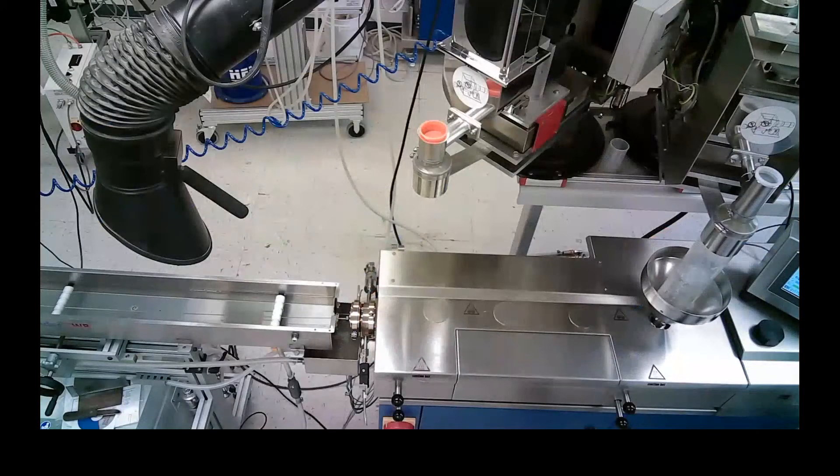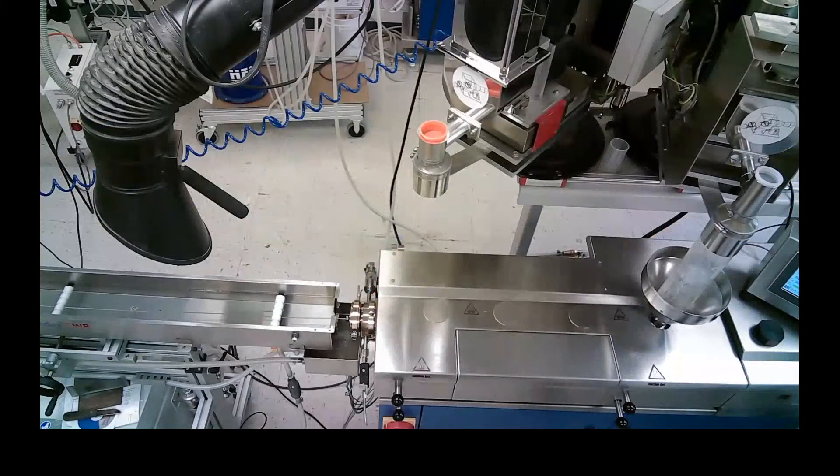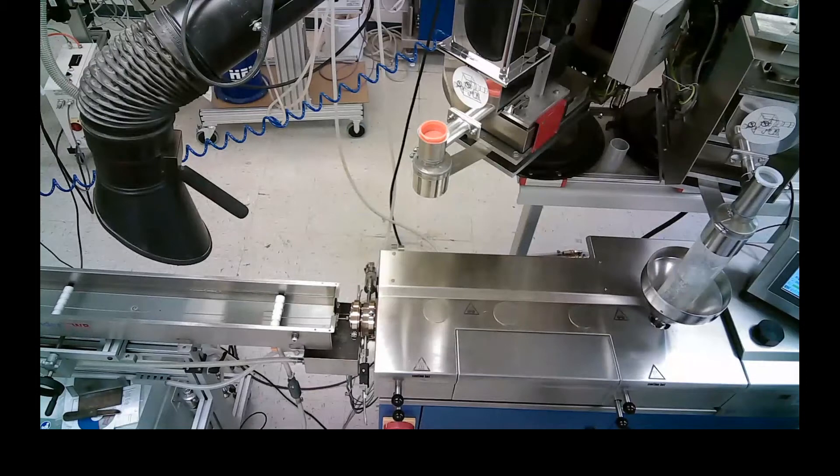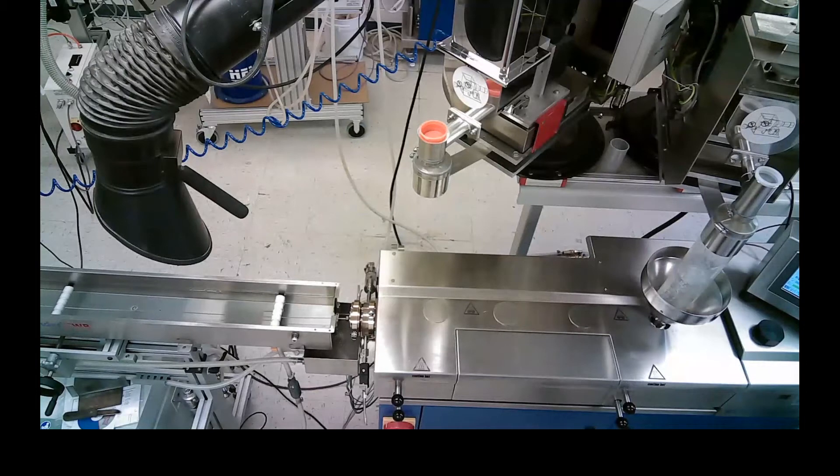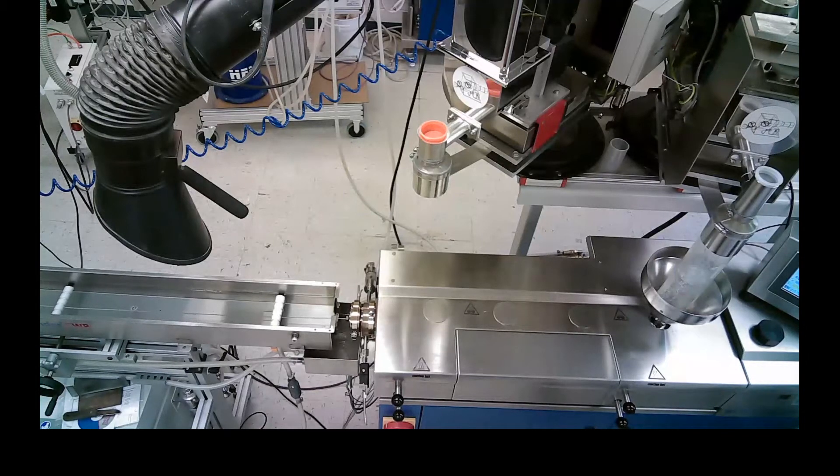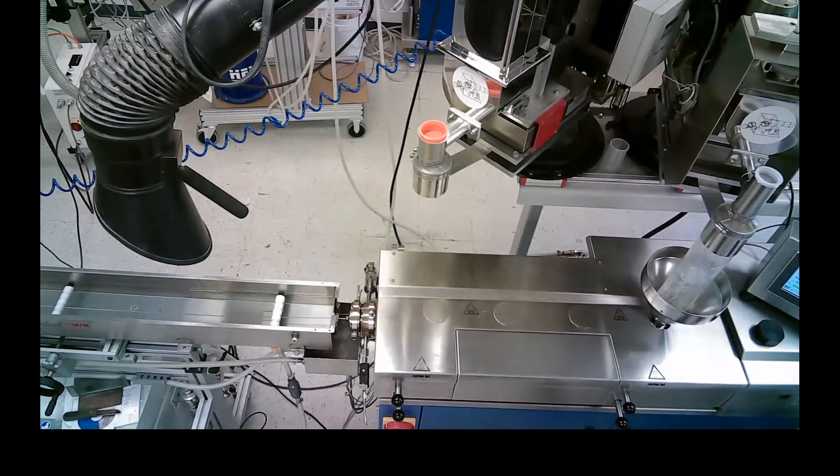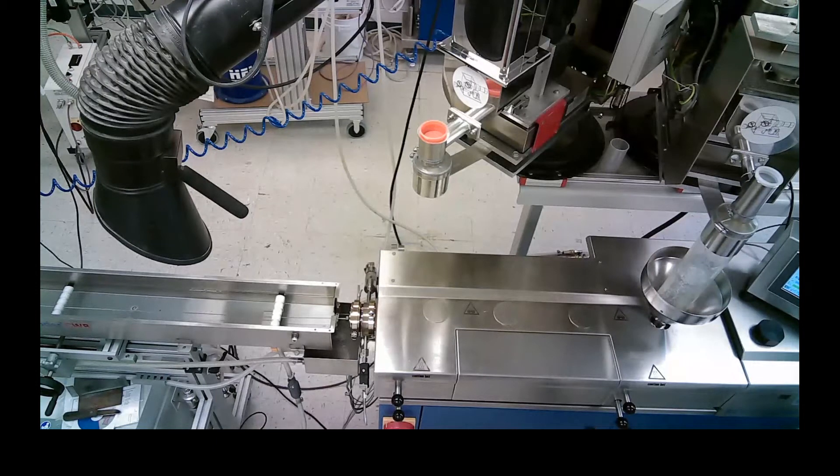I will walk you through this and after the intro you will see our discussion camera to start with where I can give you a bit of an overview of how the laboratory setup is going. Before we do that let's look at the equipment.